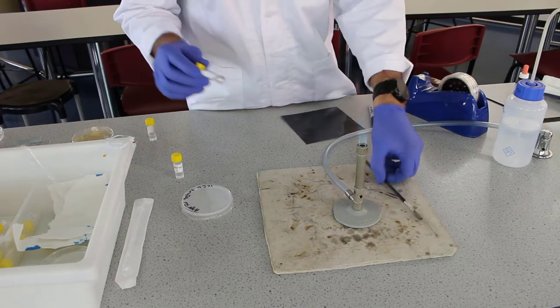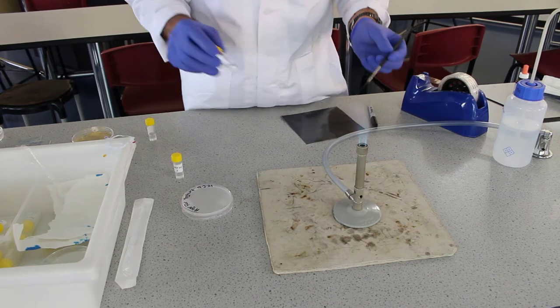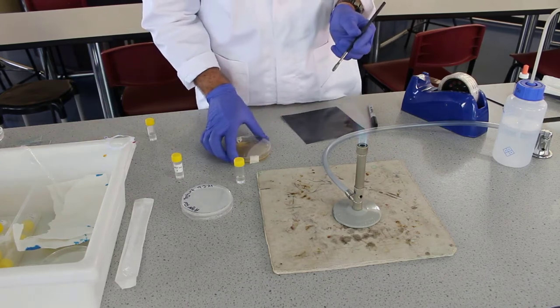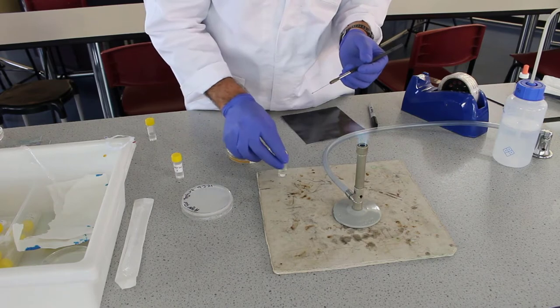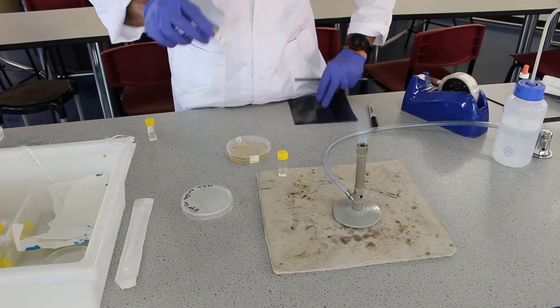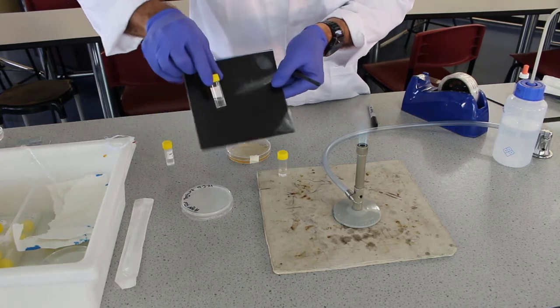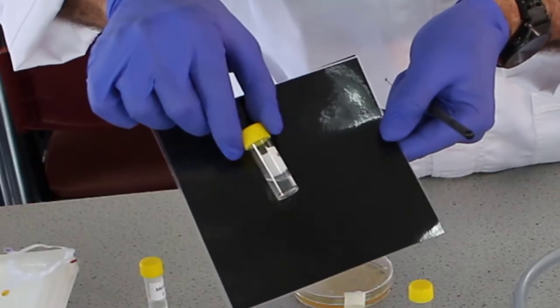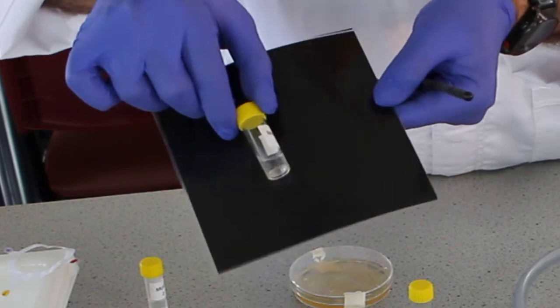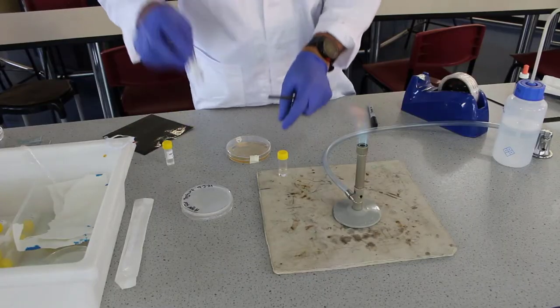Now what we're going to do is inoculate this tube with some of our single colonies. We want to make a suspension that's about as cloudy as this, which is very hard to see, but this is what we call a McFarlane standard, which is a standard of turbidity. This is a McFarlane one. This is what we're trying to match it to. It's a measure of how turbid or how cloudy the liquid is.